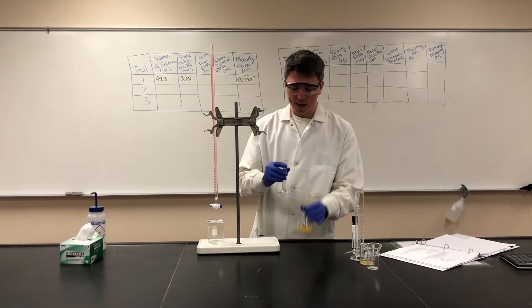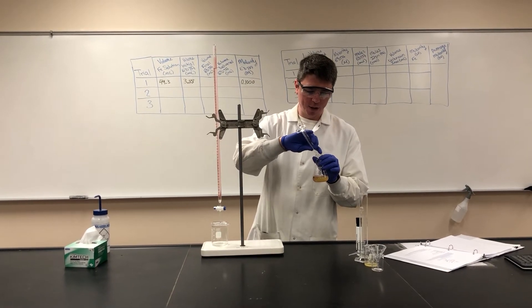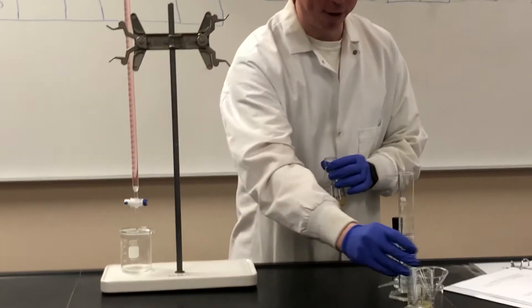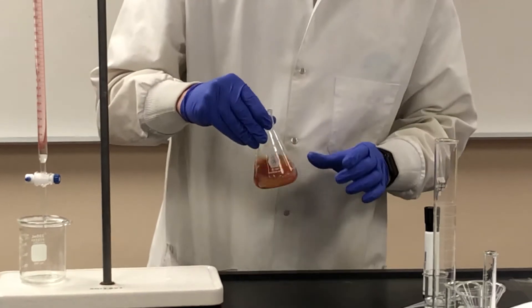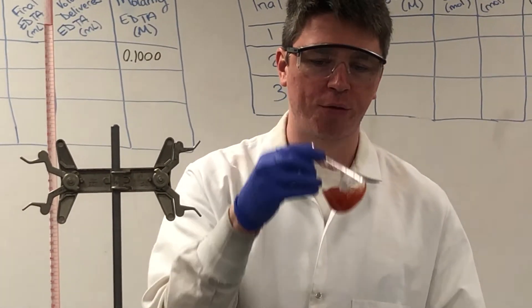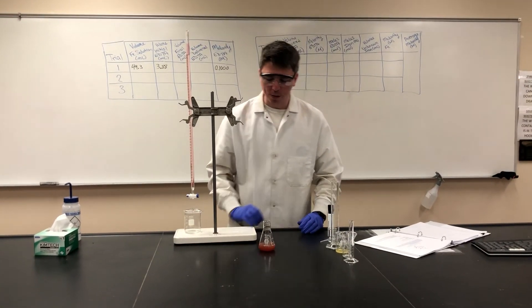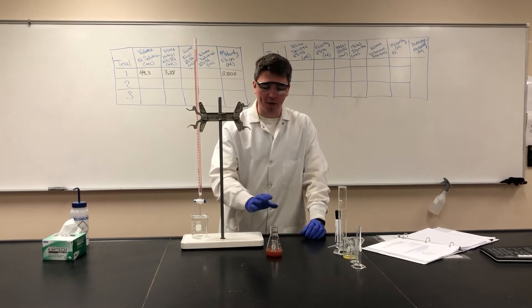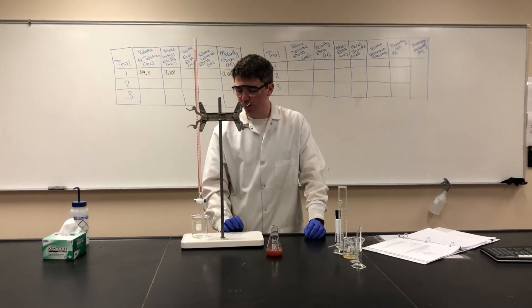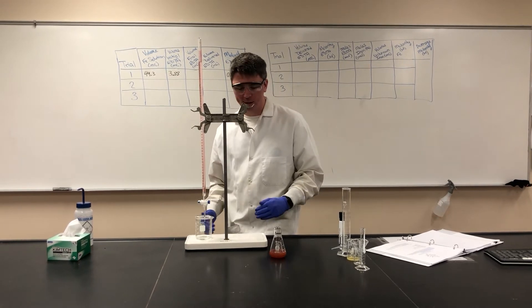We also need a little bit of potassium thiocyanate, which will give us our color change — it acts as our indicator for this experiment. As you can see, the color has already changed from a light orange to a very deep red. When we titrate, this color will go back to orange, and that will tell us when to stop our titration.